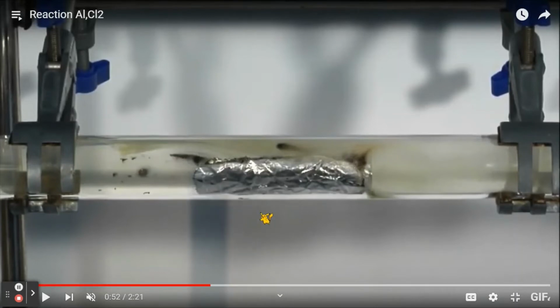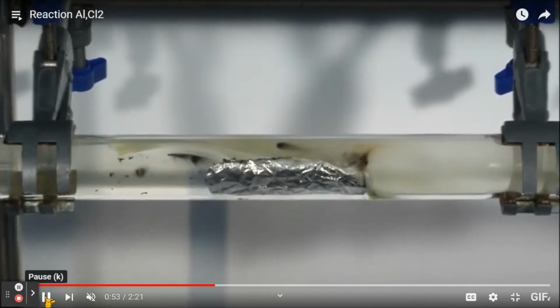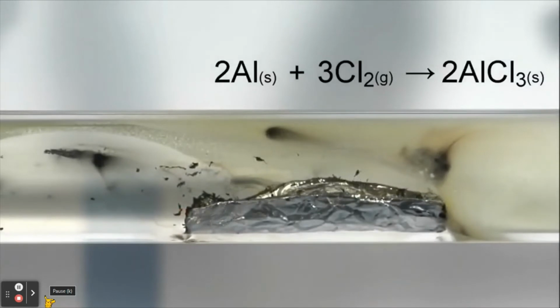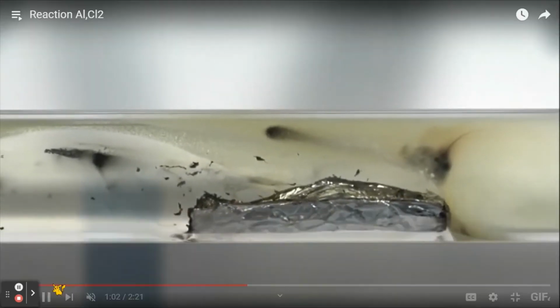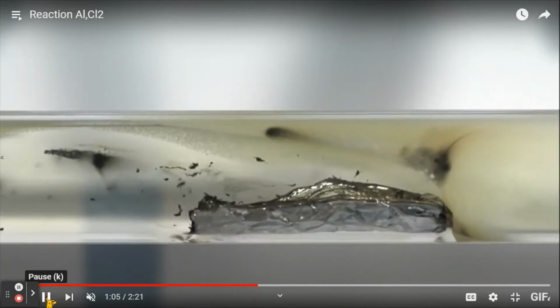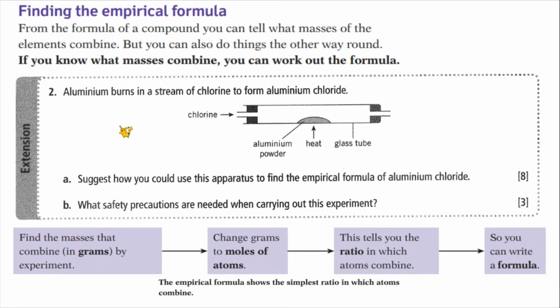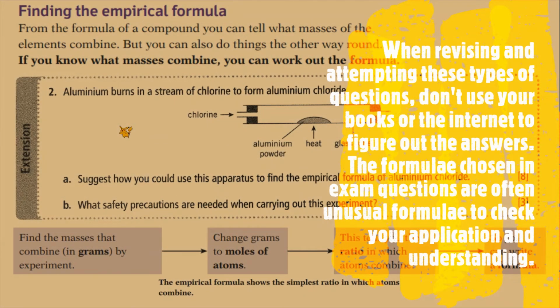Once the reaction is finished, you would then have to allow this to cool down so that you could reweigh it. Okay, so I have to assume that all of the weighing is done. I think this experiment was just filmed to demonstrate what was going on. What you can see illustrated at the top, you wouldn't necessarily know if you were doing the question like this. So the best thing to do would be to work through questions like this, and if they give you data, work through it yourself.